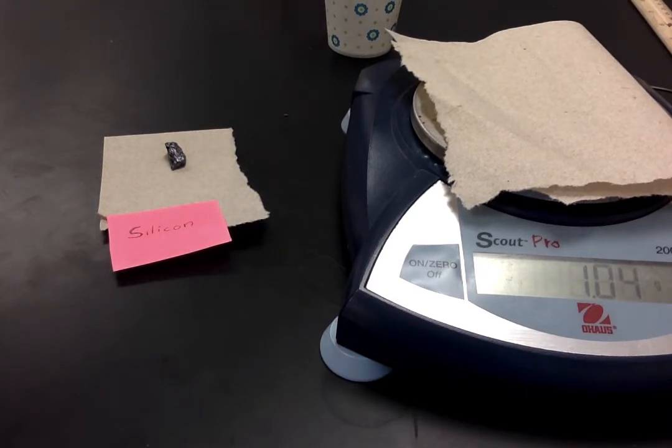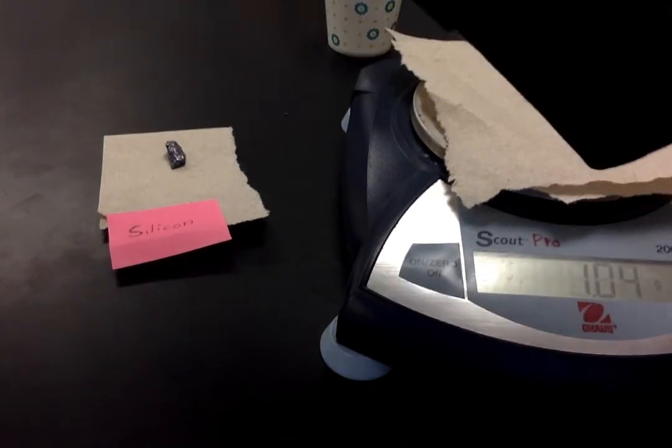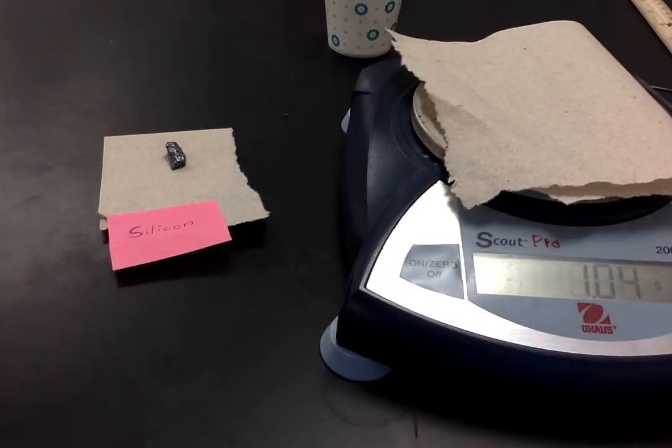And so what we're going to do is try to determine the density of silicon. We're going to do that the way we've been doing it. We're going to find the mass, determine the volume using water displacement, and then you're going to calculate the density.